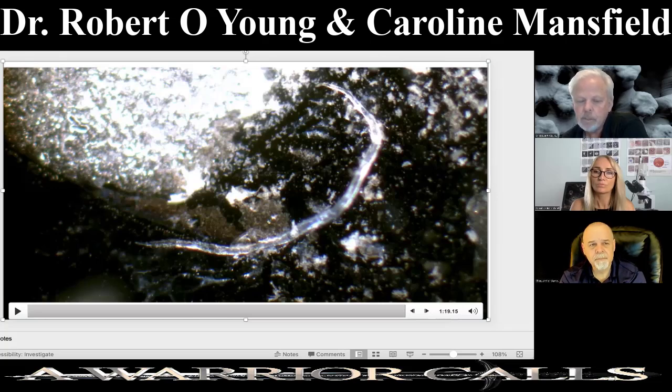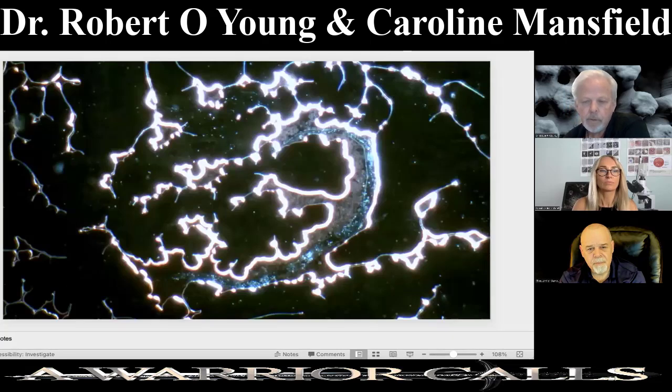I mean, that's not surprising at all. So I'm not shocked by any of this. If you go back to the other slide, Caroline, showing the dried portion there, a lot of this material that you see, these little thin lines, are proteins that I would suggest are part of the clotting factors, factor 7 to factor 13.